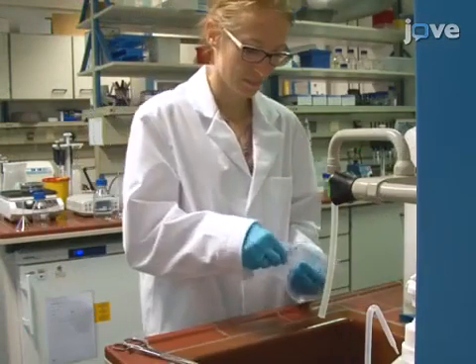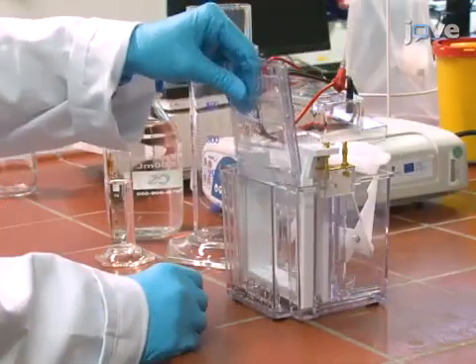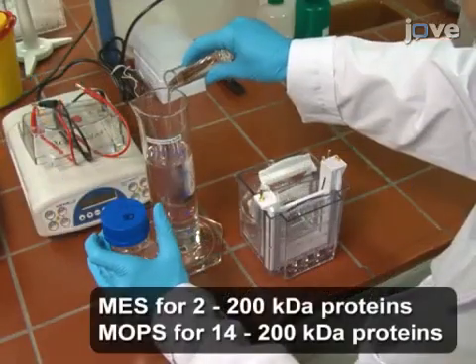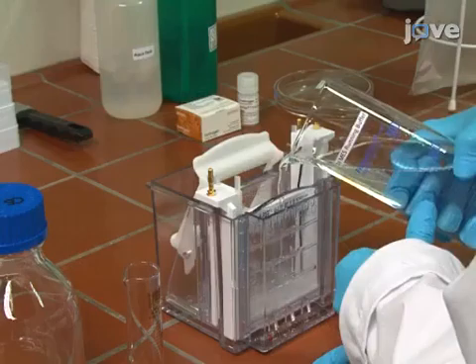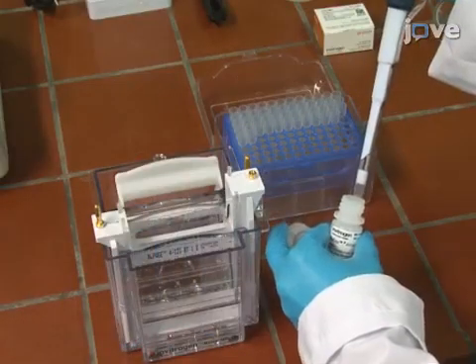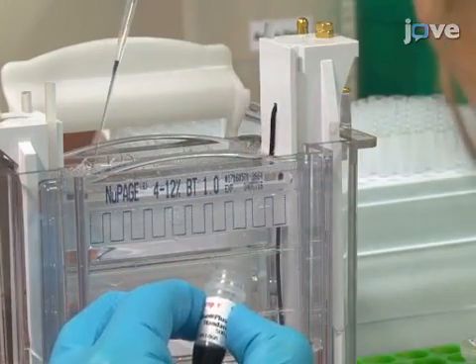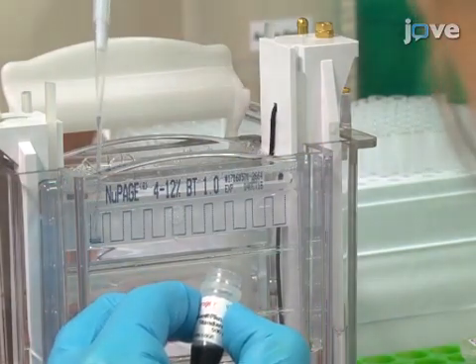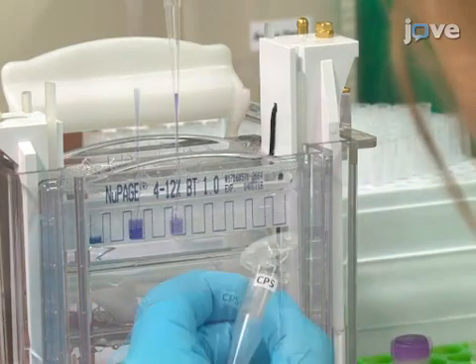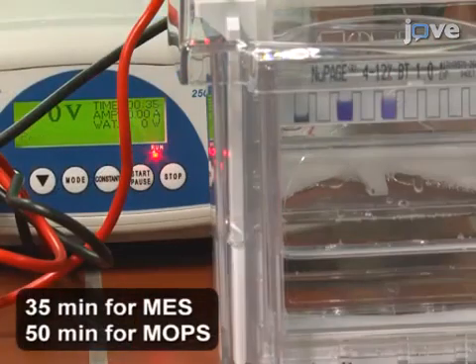Prepare a 4 to 12 percent gradient gel for electrophoresis and place the gel into the electrophoresis chamber. Dilute previously prepared running buffer 20 times with water and fill the electrophoresis chamber, then add 0.5 milliliters of antioxidant to the inner chamber. Load a suitable protein marker in the first cavity of the gel and the protein samples into the remaining cavities, then separate the proteins for the appropriate amount of time at 200 volts.